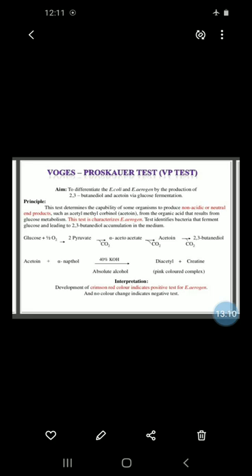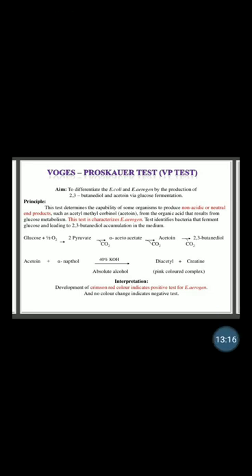This test is characteristic of E. aerogenes. The test identifies the bacteria that ferment the glucose, leading to 2,3-butanediol accumulation in the medium.